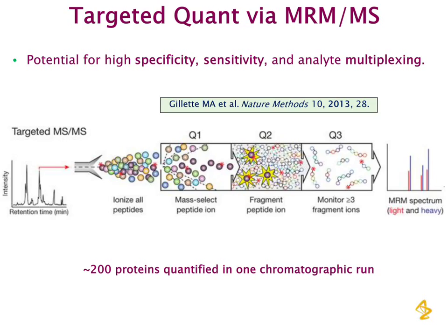elution. Finally, triple quad instruments support so-called scheduled MRM mode, where analysis of subsets of transitions is required during established retention times. This means that an automatic setup of multiple time segments is obtained to maximize the dwell times of each transition, thereby improving the detection sensitivity. This translates into high multiplexing capability. The highest number of proteins quantified during a chromatographic run, including the use of internal standards, that I have come across is 192 proteins, which has been reported by Andrew Percy and co-workers at the University of Victoria Proteomics Center.